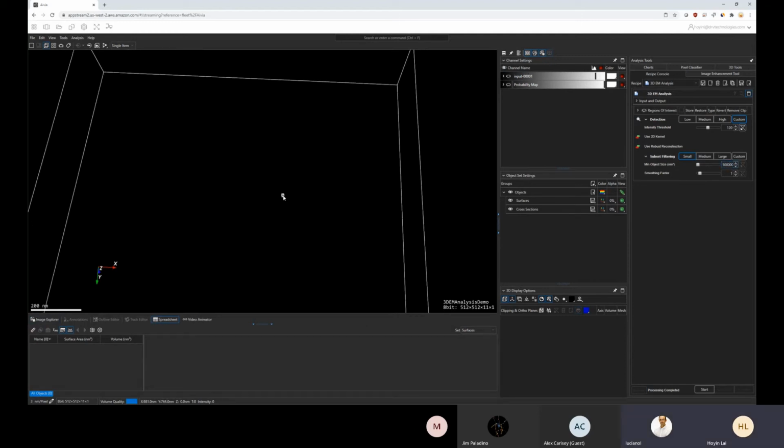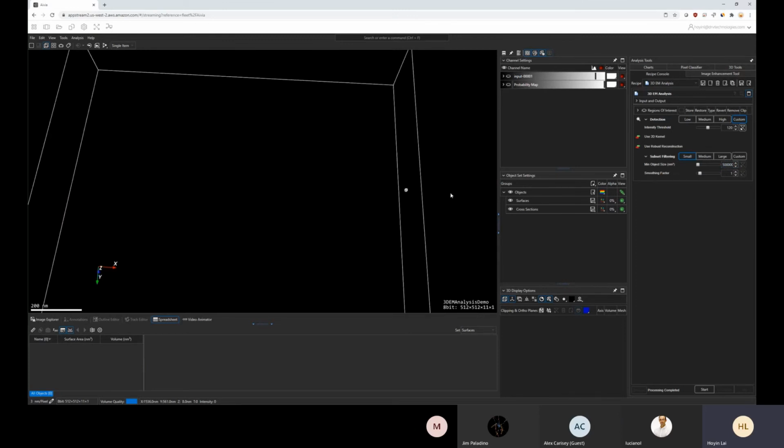Yeah, even after applying, you can see that I have the parameters set incorrectly, so I'm not seeing any mesh at all. You're not getting any? Okay. Yeah, I might need to dial it down by quite a bit. So just say 2,000. Object size, I think it's a lot less. And you could also try the ROI apply so that you don't have to wait so long. Good idea, actually. Yeah.